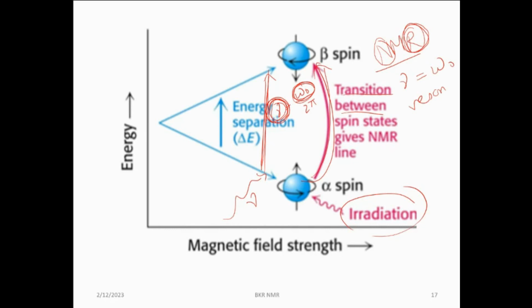and then you can study the NMR. You will feel that why am I teaching you all this, but these are very important because while problem solving, like shielding and de-shielding, if you don't know this, you will never understand. So the radio frequency I give will match the precessional frequency. So now I can precess.